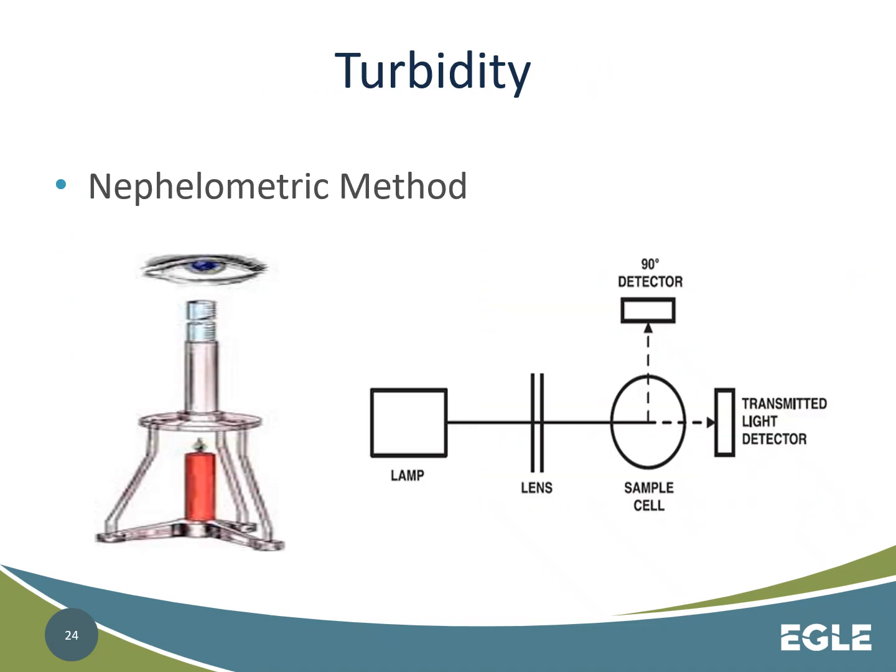Next analytical method we're going to be talking about is turbidity. Turbidity has a number of different modules that are devices that are used for calculating turbidity, but there is only one approved methodology, and that's the nephelometric unit. Typically, turbidity is reported as units as NTU, which stands for nephelometric turbidity unit, is what that stands for.